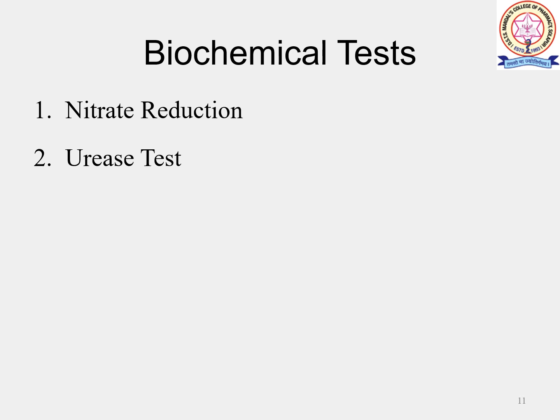A urease positive culture produces a purple pink color. Urease producing bacteria are able to break down urea to ammonia. Because of this conversion, it will produce the purple or pink color.